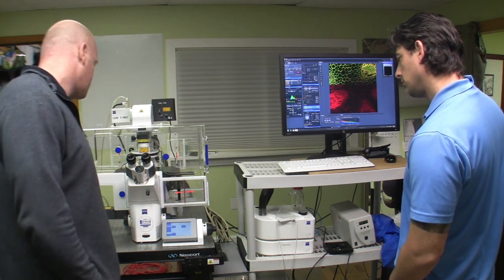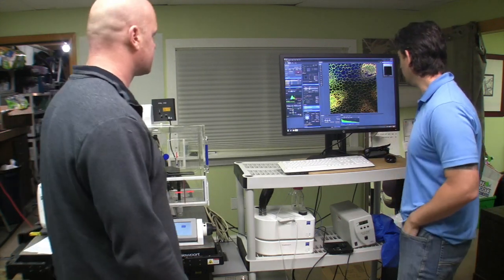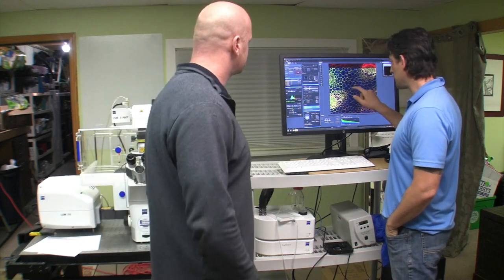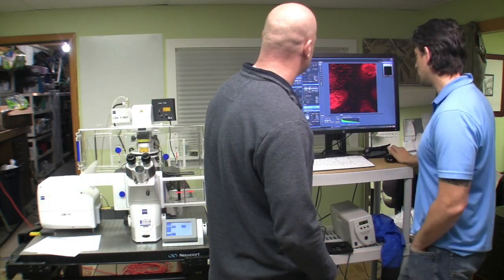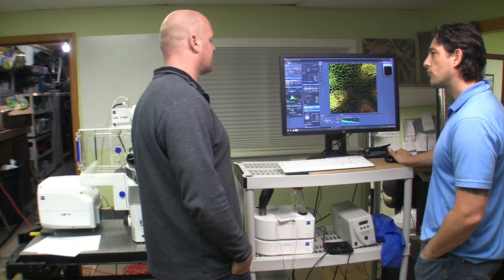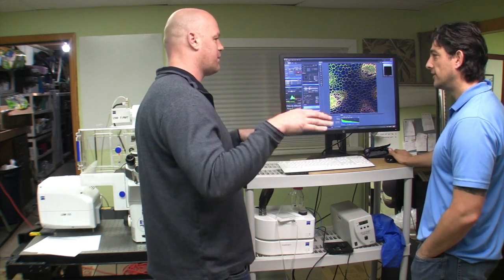We didn't even float the table. I mean, look at it, not necessary. If the table wasn't floating and there were vibrations in the room, you'd see the zigzags, the fuzzies. It's so obvious you'd notice right away. MRIs are like that. Oftentimes you actually have to build a pad that the MRI sits on.